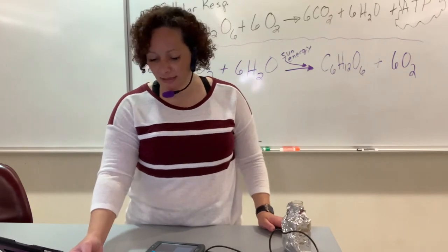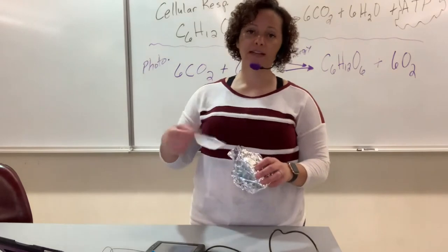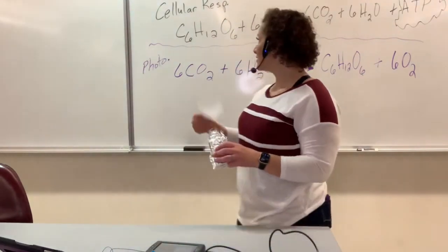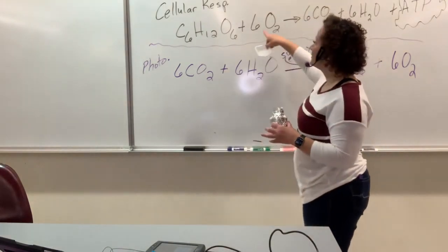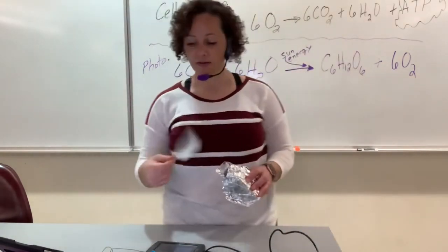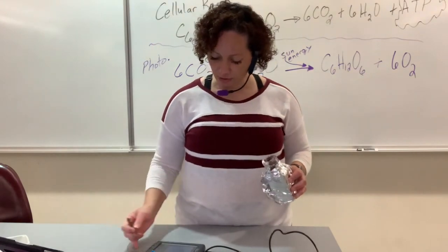Once you get all that done, you can let it breathe. And this really comes in handy. Provide it some oxygen. Why would I provide my organism some oxygen? Well, because in cellular respiration, you need oxygen. That is why. Give it a little oxygen. And then clear your machine.